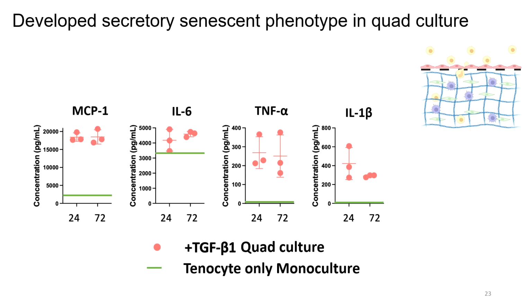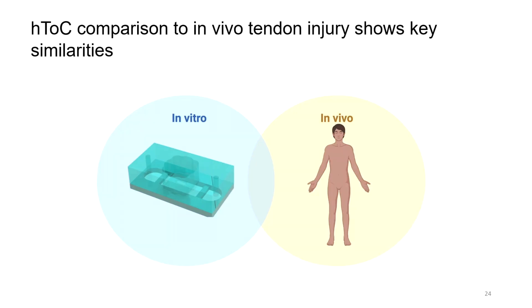We performed additional analysis to see who is actually driving this secretory profile, and we identified that the monocyte that we add onto the vasculature side is really the main driver of either inducing the secretory profile in the other cells or itself secreting a lot of these secretory cytokines. And again, it plays a very big role because it's activating the endothelium itself. It could be transmigrating to the bottom construct, so it's a very, very important player.